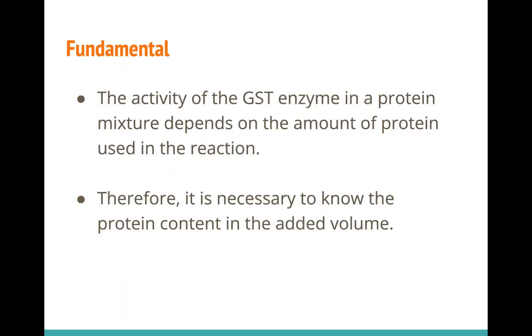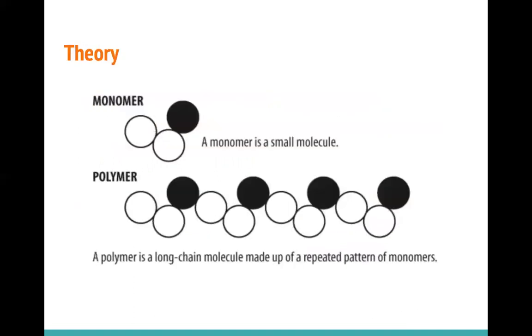The fundamental of these experiments is that the activity of the GST enzyme in a protein mixture depends on the amount of protein used in the reaction. Therefore, it is necessary to know the protein content in the added volume.